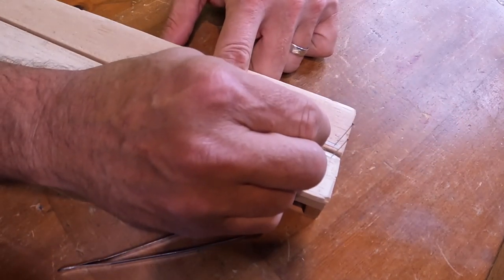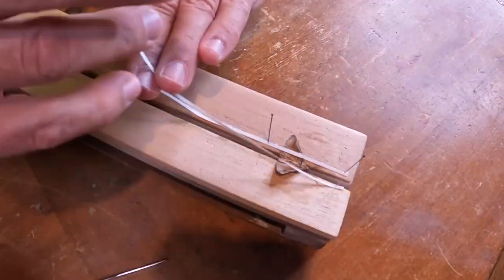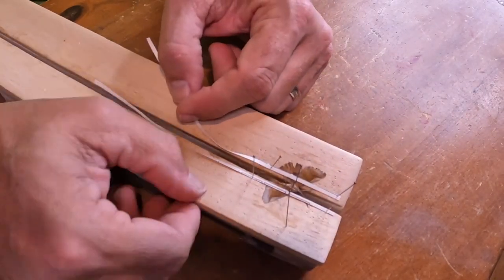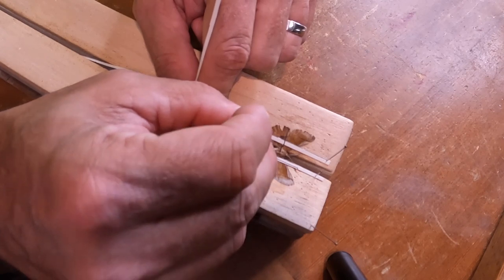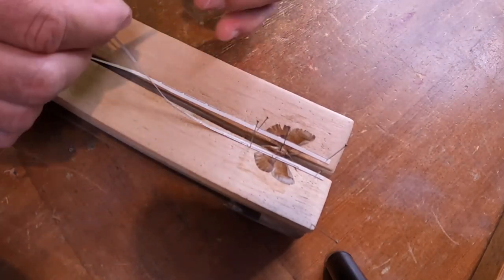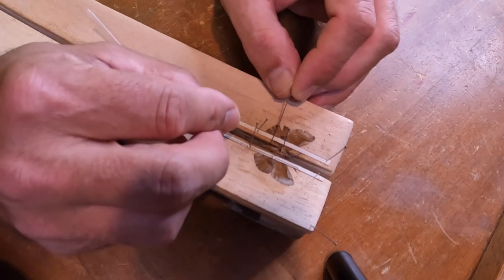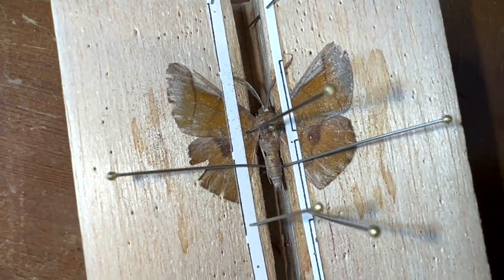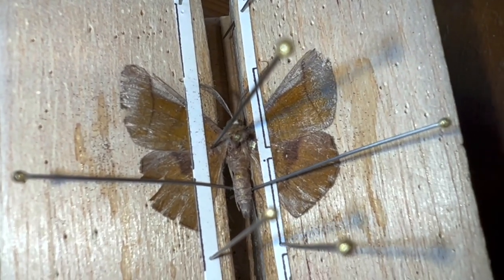We don't know what species for sure, but we're almost there - looking good! Boom, booyah - look at that beauty! Now I'm just going to brace the abdomen underneath two pins, make like a V to brace the abdomen so it doesn't droop down. We have our undescribed specimen - or this could be Hattieria. Sphacilotes or Hattieria, I'm not sure.